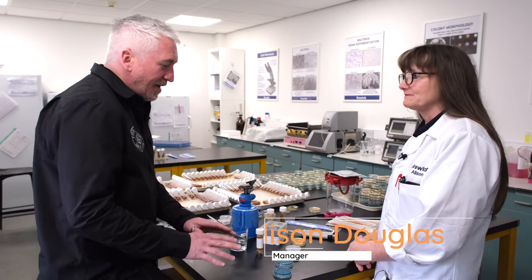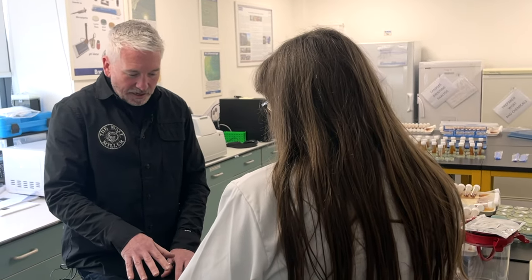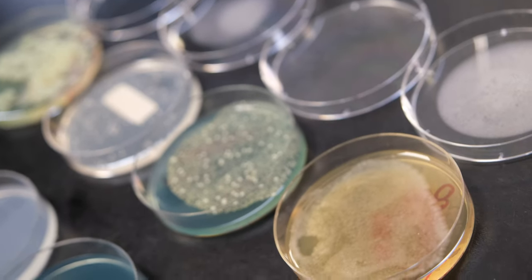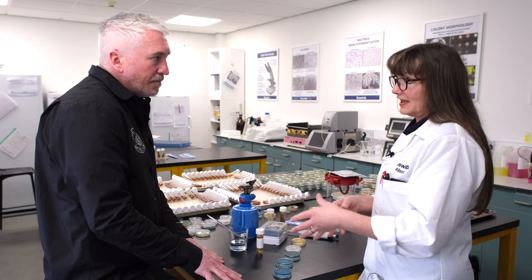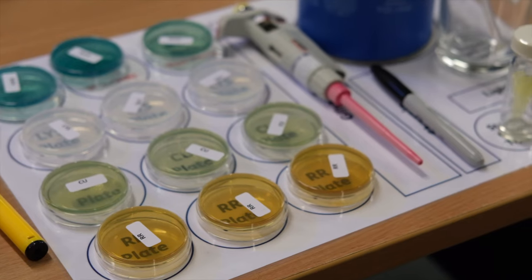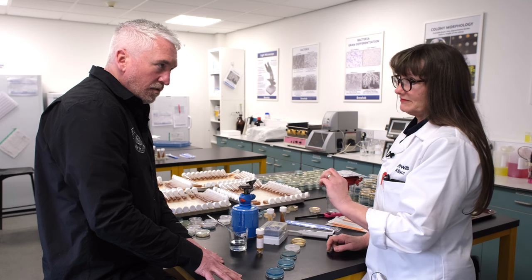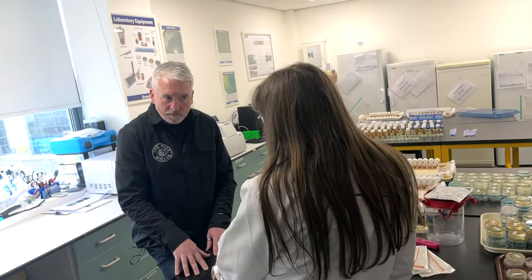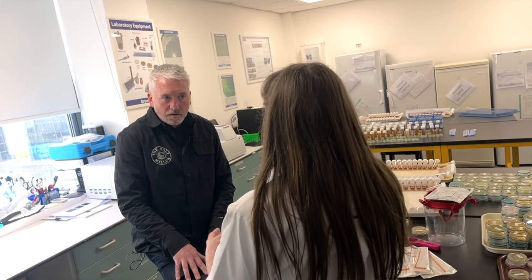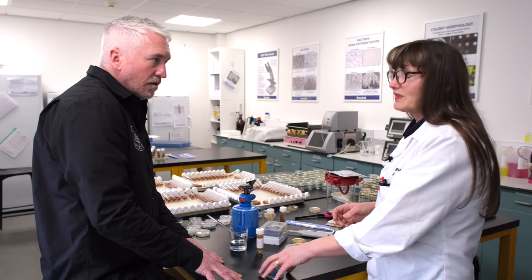In this section we're going to be looking at contamination of yeast. We've got various different plates here. These are a selection of agar plates - essentially a jelly impregnated with different nutrients that allow certain organisms to grow. The first one is called WLN, Wallerstein Laboratory Nutrient, and that allows any brewing yeast, any wild type yeast, and bacteria to grow aerobically. So if you want to check hygiene - a vessel, a utensil you've swabbed - that'll show up everything.